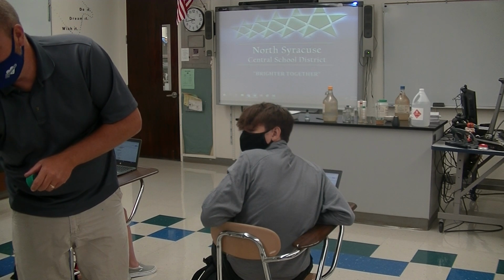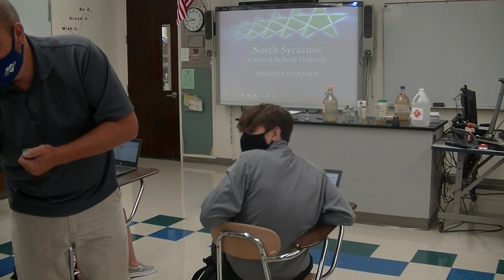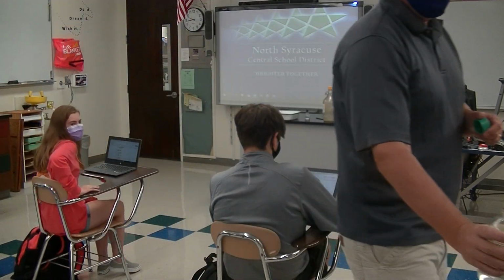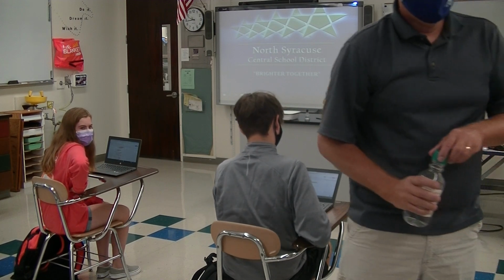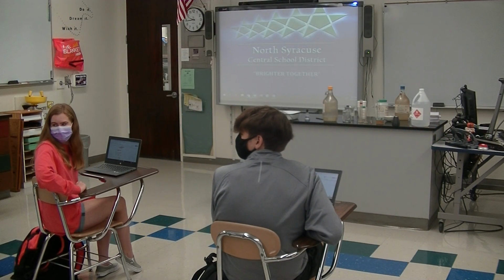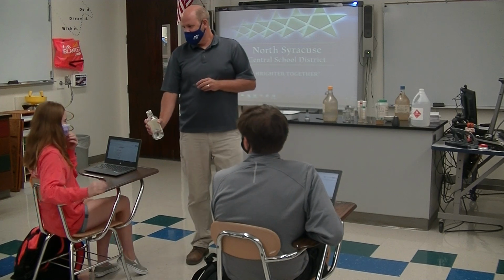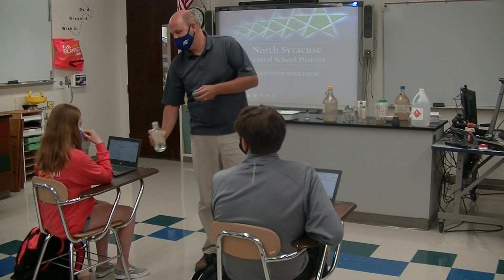You got to smell it? You don't have to smell it yet? Keep your hands closed and scoop the air towards you. You got the smell though? A little bit. Seliger? I don't know what it is. Did you smell it? Yeah. I can tell when you smell it because of your eyes. No one's got it yet. Smells like that. Yeah, a little bit maybe.